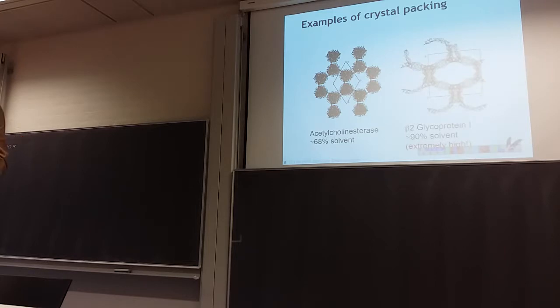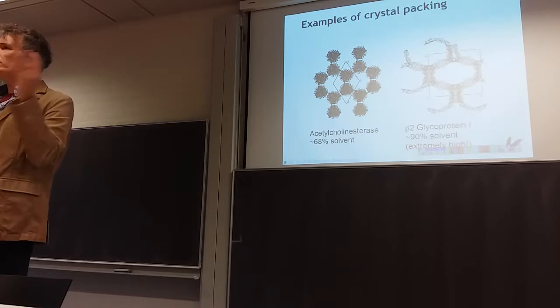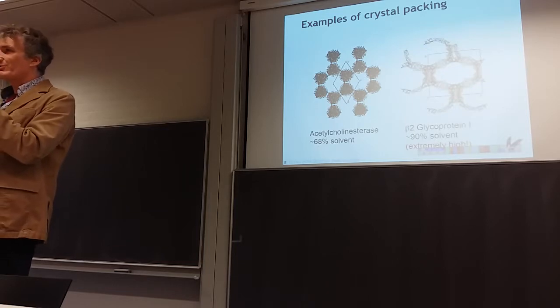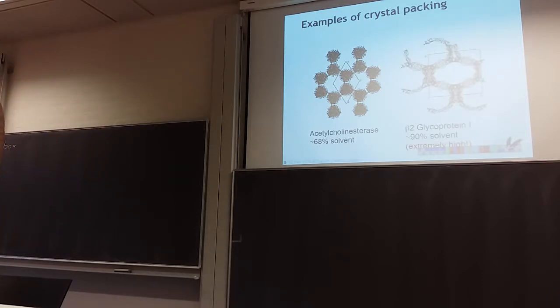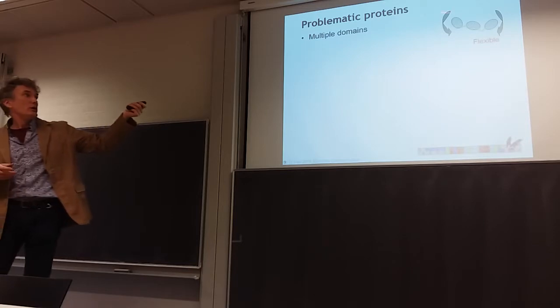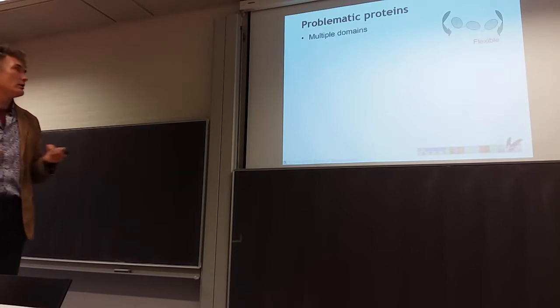That sometimes happens. The other problem with floppy bits in your protein is an entropic cost. Because if your protein is in solution, everything can move around. In the crystal, this is much more restricted. So it might not actually be entropically or thermodynamically favorable for the protein to form a crystal, because the lost entropy is too high. We'll get back to thermodynamics next week. We mentioned it already before, right? Okay. And this particularly, if you have multiple domains with flexible linkers, then it just probably won't fit into a crystal.